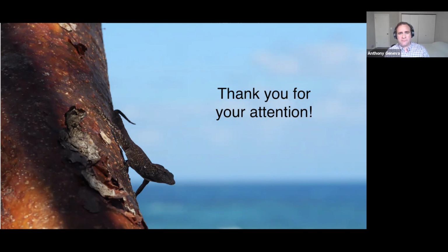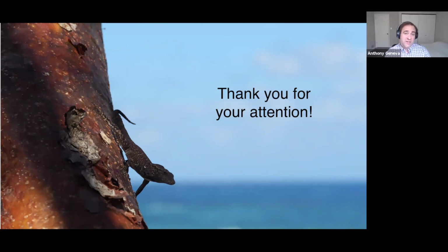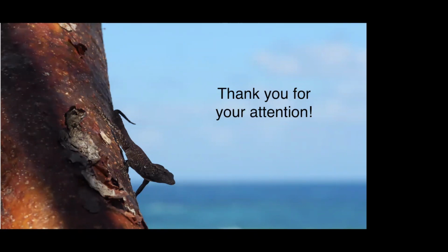Do you do polishing for all assemblies? The reason I'm asking is whether this can influence the completeness you assess in BUSCO. No. Polishing has only been done on the fragilis assembly, so 8 of the 9 are not yet polished. That's why I didn't go too in depth about those assemblies. I did that analysis for this talk. We'll obviously redo it when all of the genomes are in their finalized states, but that's a very good point.